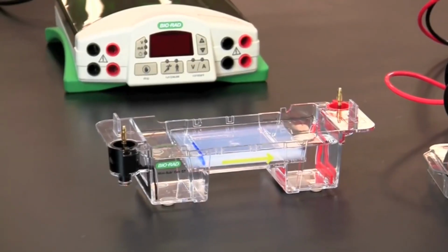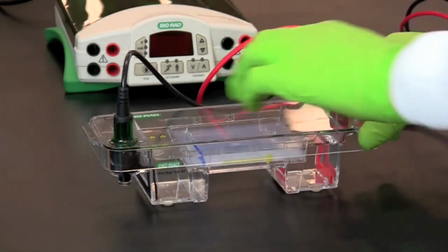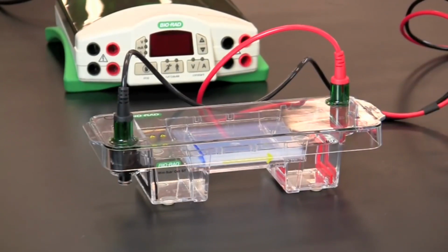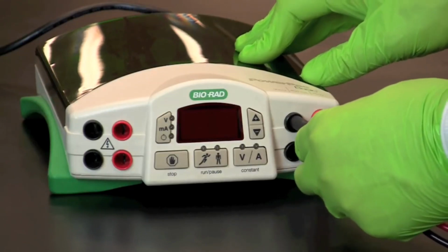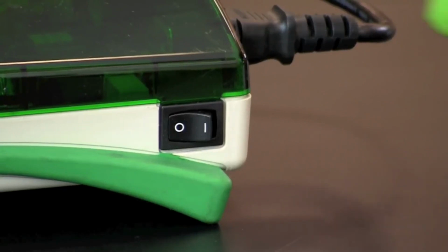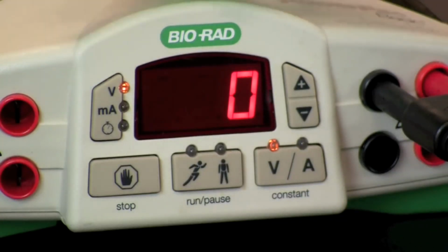Once you load all the samples, try to avoid any movement or bumping of the gel, as it could knock some of your sample out of the well. When placing the lid on the mini subcell, it's important to make sure that the red goes to the red and the black goes to the black. Now it's time to attach to the power supply. When doing so, it's important to make sure that the red matches the red and the black matches the black. It's then time to go ahead and turn the power supply on. After this, we go ahead and set the correct voltage and time to run.